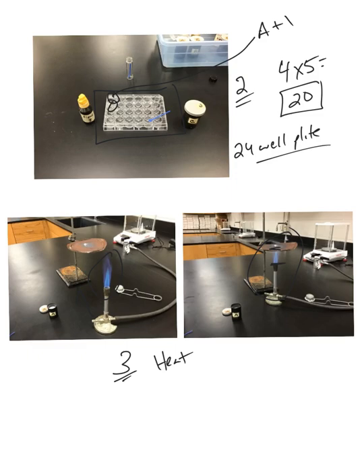Okay? So once you're done heating the substance, after 1 minute maximum, if it has not responded to heating by then, it's not going to. By then it's several hundred degrees Celsius. If it hasn't done anything to heat, it's not going to.